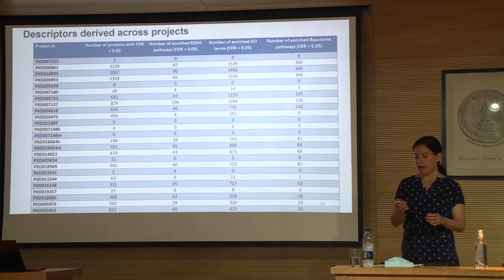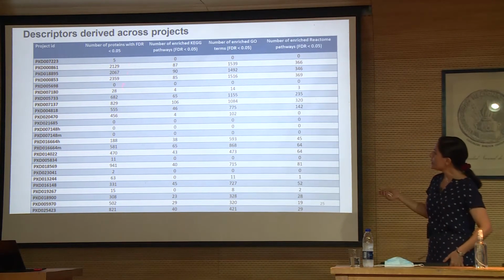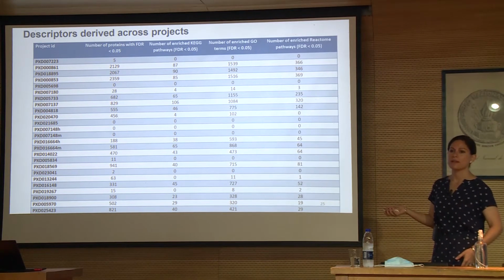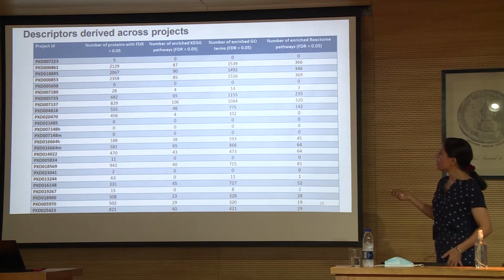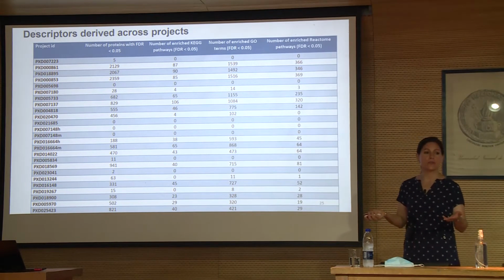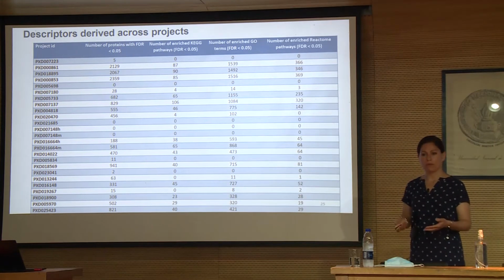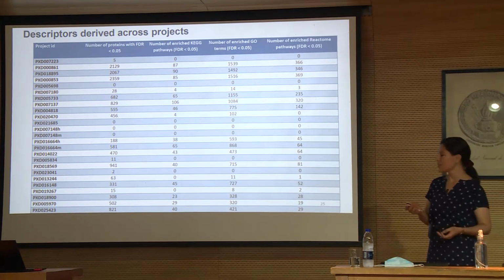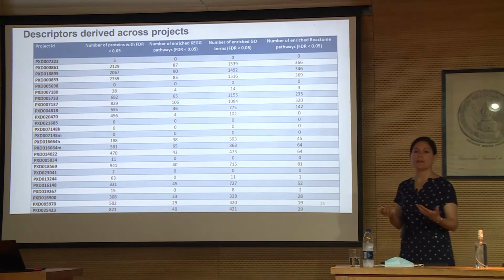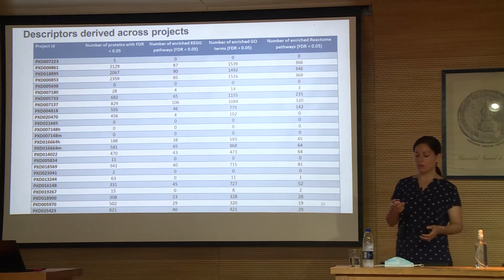And that's why here I have a set of around 20 projects that I'm going to show. Here we make a cut for how many proteins we consider to be significantly altered and how many KEGG pathways are altered. You can add these terms as we saw before, however you are used to. The workflow can also implement this automatically. You can also add the GO terms or Reactome, and if you have any other that you can consider to be a descriptor, the workflow can include that.